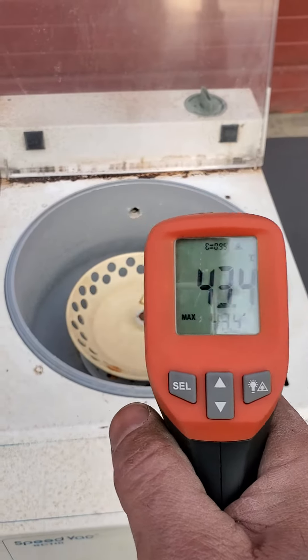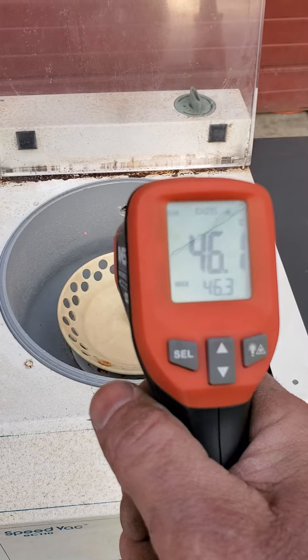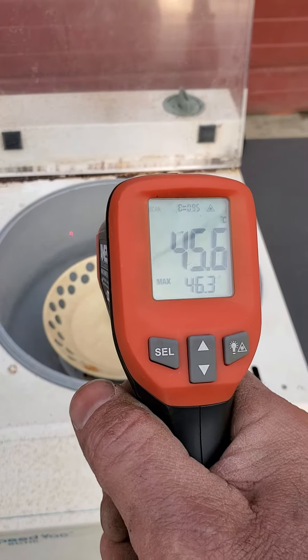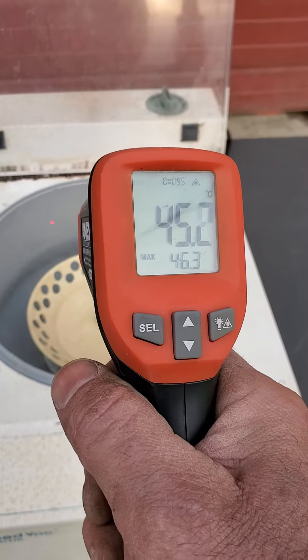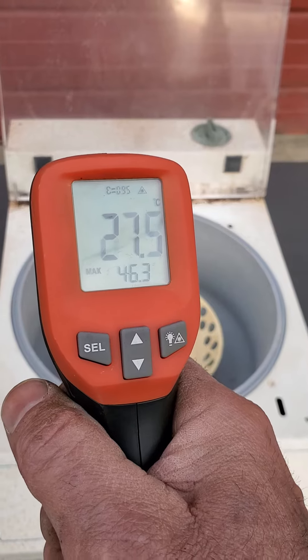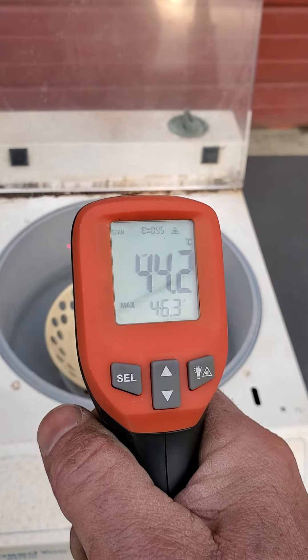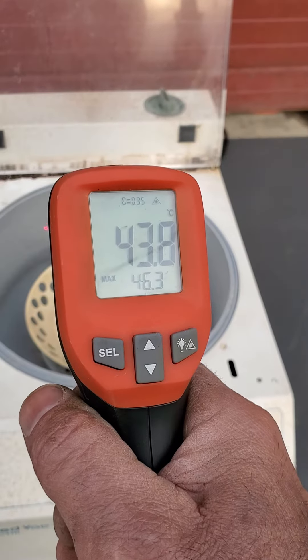If you get the laser point in there, as you can see, it shows about 45 degrees. And outside it reads 32. That's because we had been using it before. But let's power it up and see.